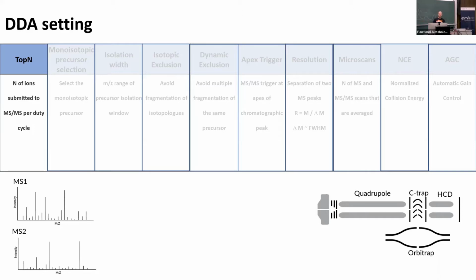Now, unless you have an ultra fast instrument like a timsTOF or so that can actually provide you with fast enough speed, the odds are that you will end up in that scenario and you do not get enough data points. You don't even reach the 5 data points I mentioned before, so you cannot represent any peaks on MS1 level.